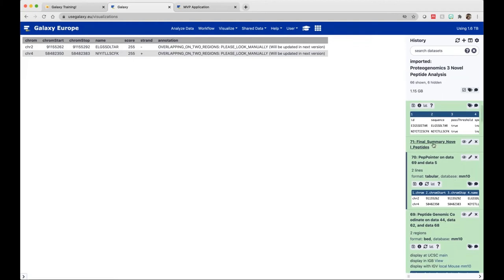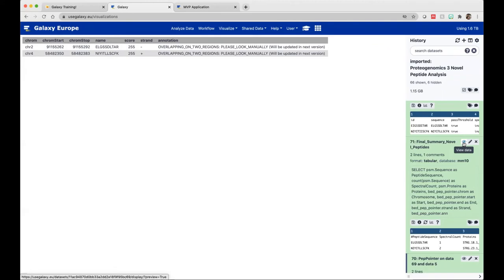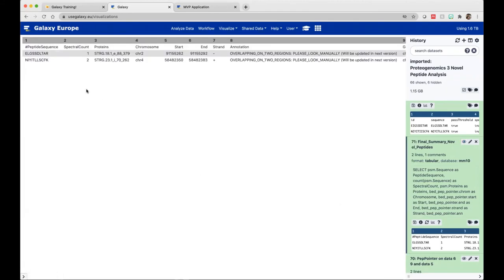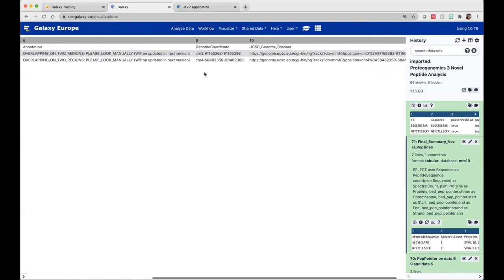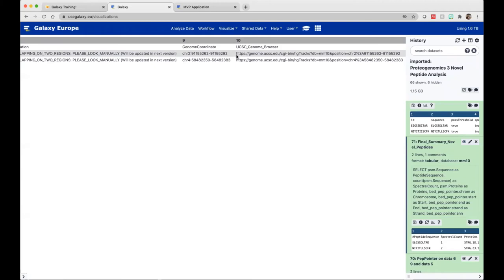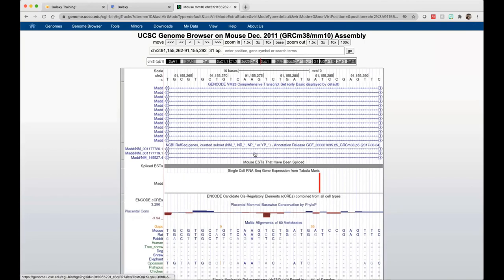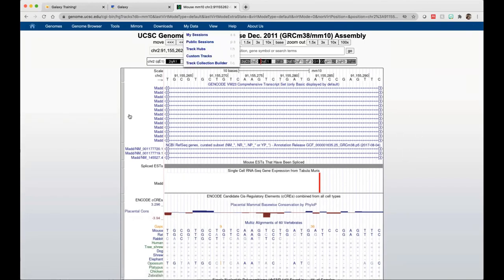The last thing in our workflow is the summary of these novel peptides. I click on the eye icon and here is the summary. It's giving me the peptide sequence, the spectral count, the protein it's coming from — E means exon, I means intron — the chromosome, the start and end, the strandedness (reverse or forward), the annotation, the genomic coordinates, and a link to the UCSC browser. I can copy that link and open it in a new tab, which will give me the location of that peptide on the reference genome in the UCSC browser.